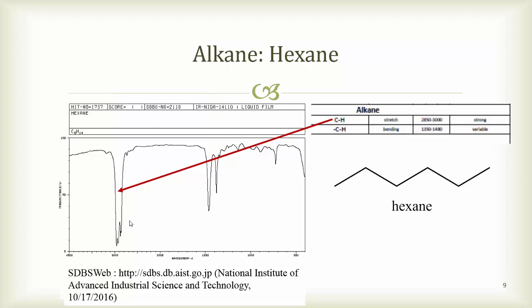The ones that we are going to focus on are in the functional group region, which is 1500 and greater. And as you can see, there is a very intense band here just below 3000. The region that we see these carbon-hydrogen sp3 stretches is between 3000 to 2850 in general. And I want to make one other point as we look at spectra, that the intensity of the transmittance isn't actually very important. It's the location of the peak that matters the most.